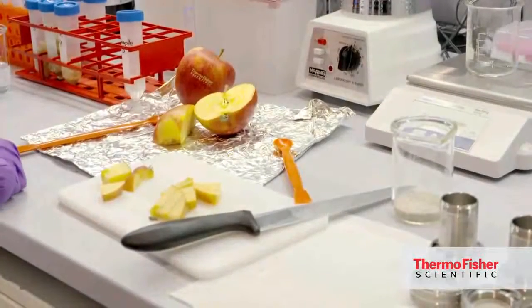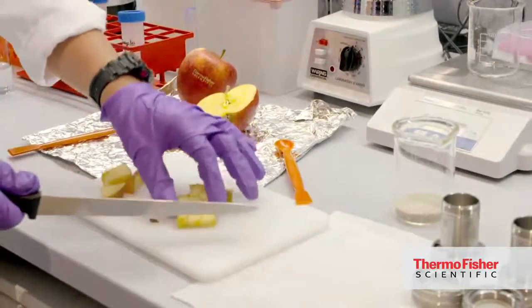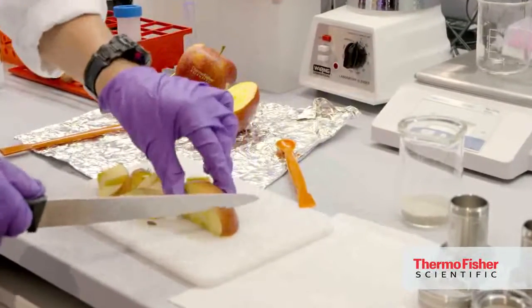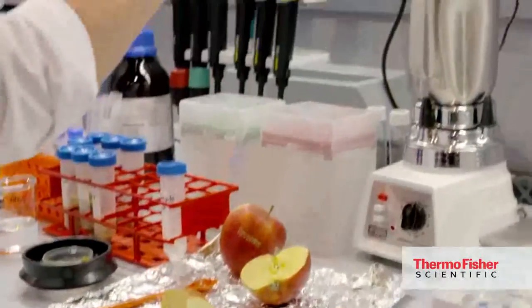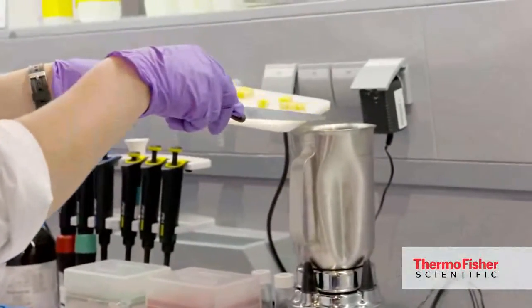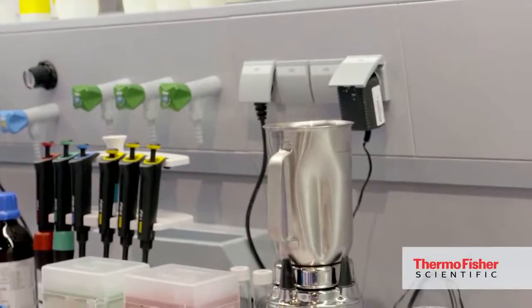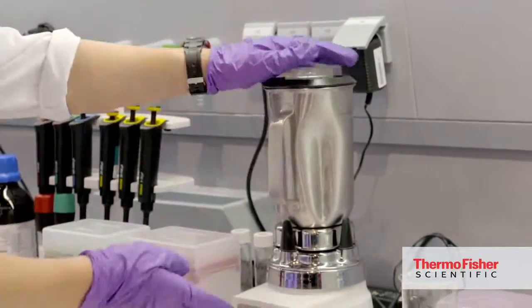So we are doing pesticide analysis, and for that, first of all, we take an apple, the sample, and we chop it, making it ready for the homogenization. So the chopped sample will be put into the blender. This is like a normal kitchen blender. And like at home, we just put it on.